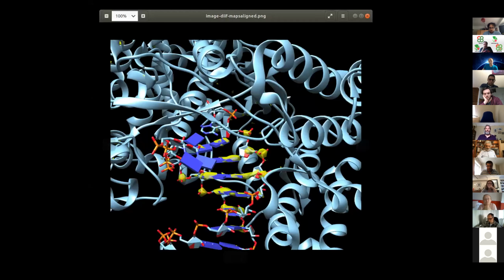So I just put my difference map up. You can see the yellow bits are the difference maps. They really sit nicely, strongly bold, on the phosphates, and the bases are really strong. And that's with scaling the two maps from the same group. Can you play a bit with the threshold for the differences?